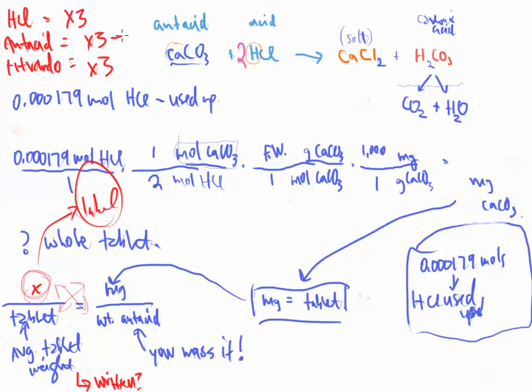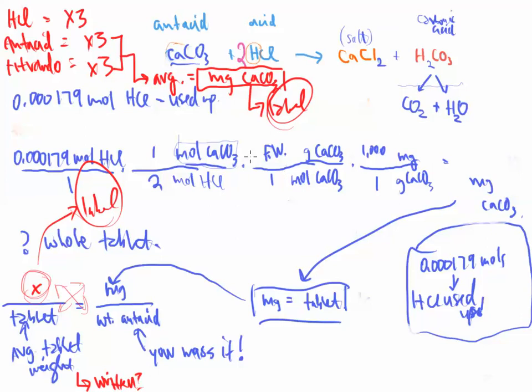You will average those up and report the milligrams of CaCO3 that you have found. You'll relate that to the label through the ratio and proportion step. And hopefully you'll get a number that is close. All right. So that's it for the math.